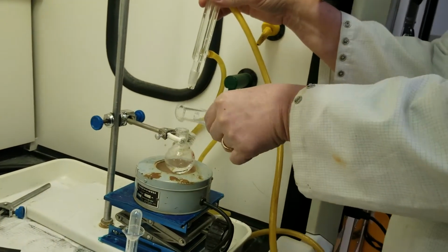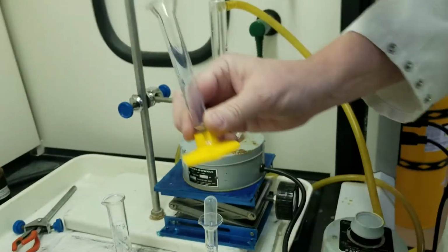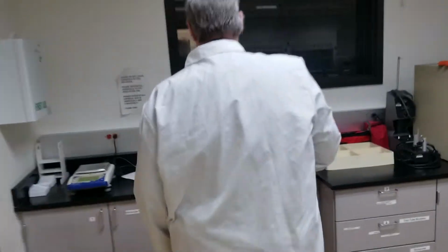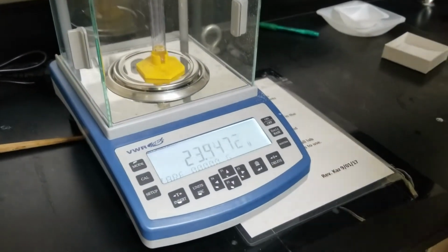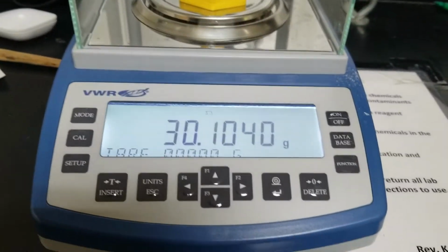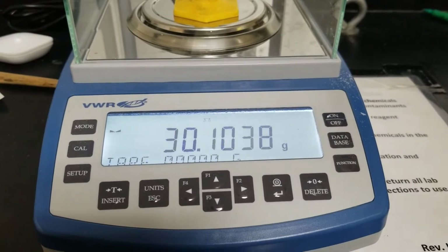So the glacial acetic acid is now inside. I'm now going to weigh this one, which is the acetic anhydride. Pour it in and weigh it again. Come with me. Are you ready to weigh? Yep. Okay. Hopefully it won't evaporate too fast. Right there. Okay, write it down.